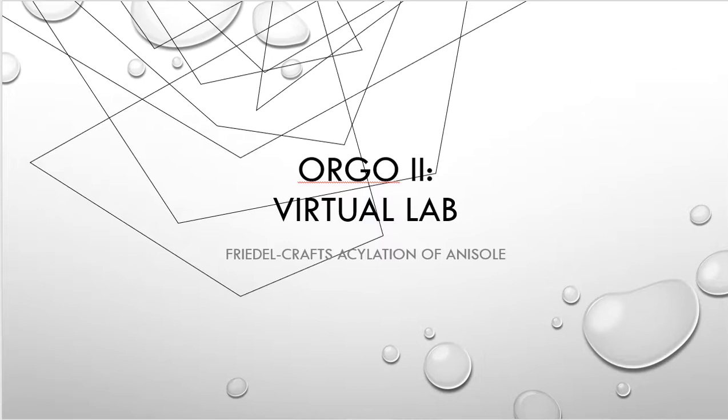Next is this term acylation. When we look at acylation, that's also pretty important. We've seen this many weeks ago, and we might really continue to see it right now when we watch this laboratory video together. And then we take a look at the last word, which is anisole. And we know what anisole is. At least I hope you know what anisole is, because we spent quite some time in lecture on anisole and all of its related cousin structures.